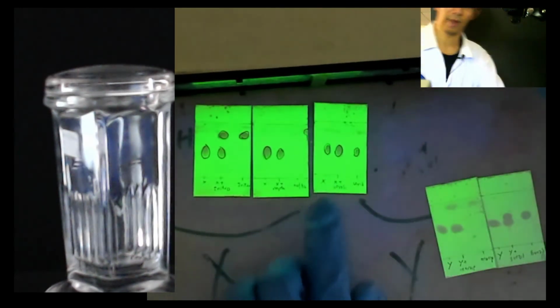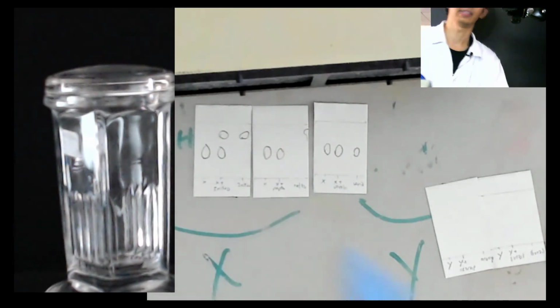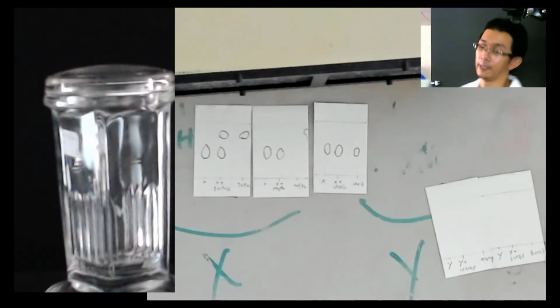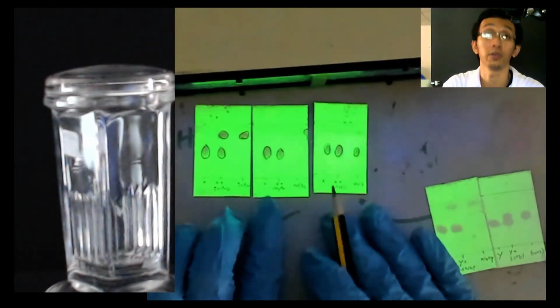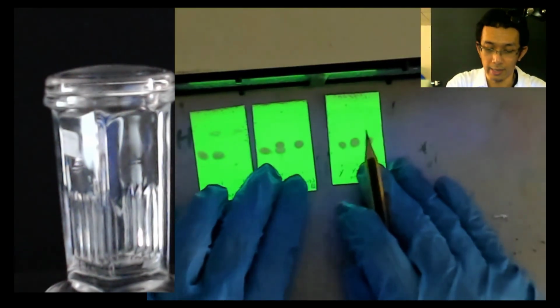So now if I close this, then you can see what we call the trace there, and this is useful for you to check the RF later on. So let's do for the Y. Okay, this is for the X. So let's do for the Y. Okay, so that is Y.